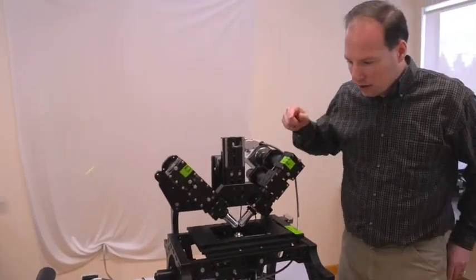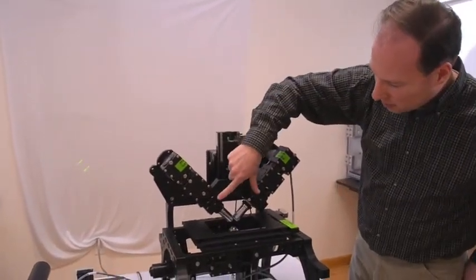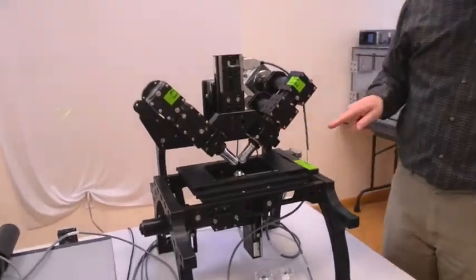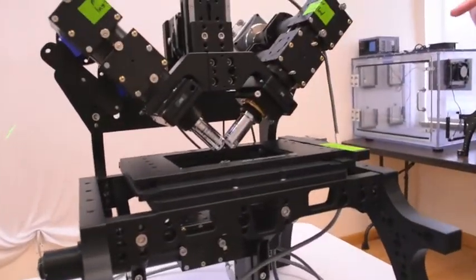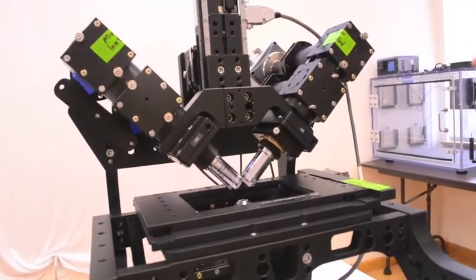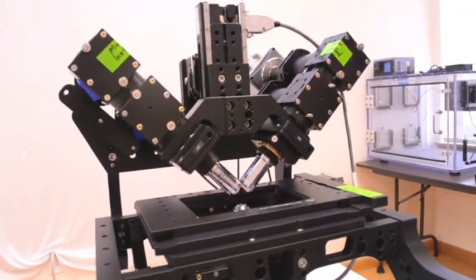So two other things just to note is we have two piezo objective movers here. So the piezo objective movers are used to keep the imaging objective in focus with the light sheet as it passes through the sample.